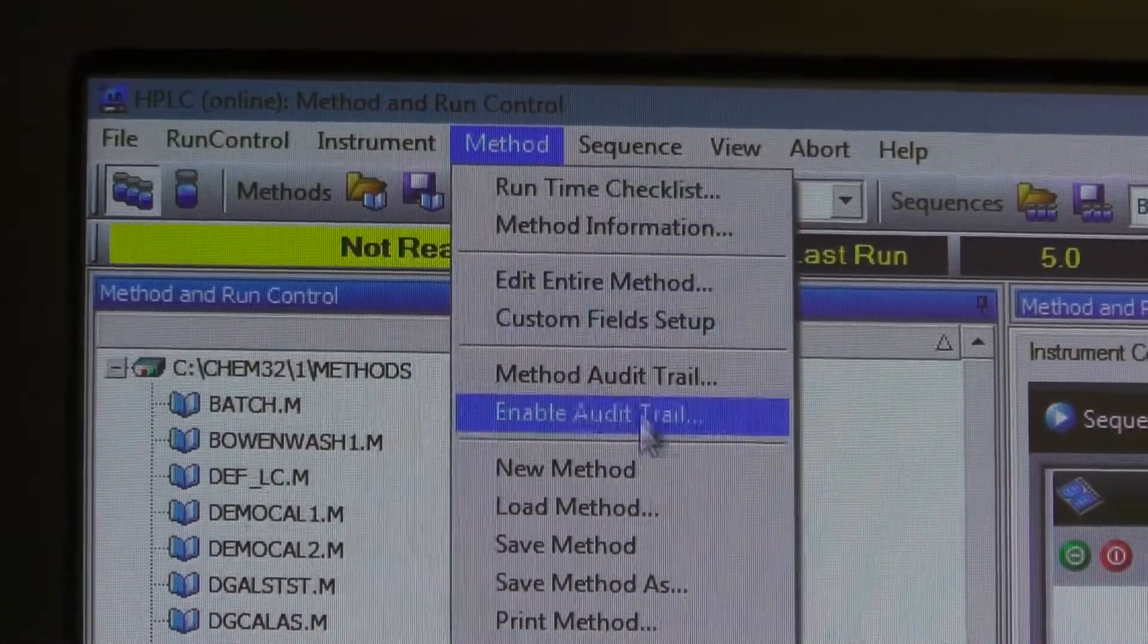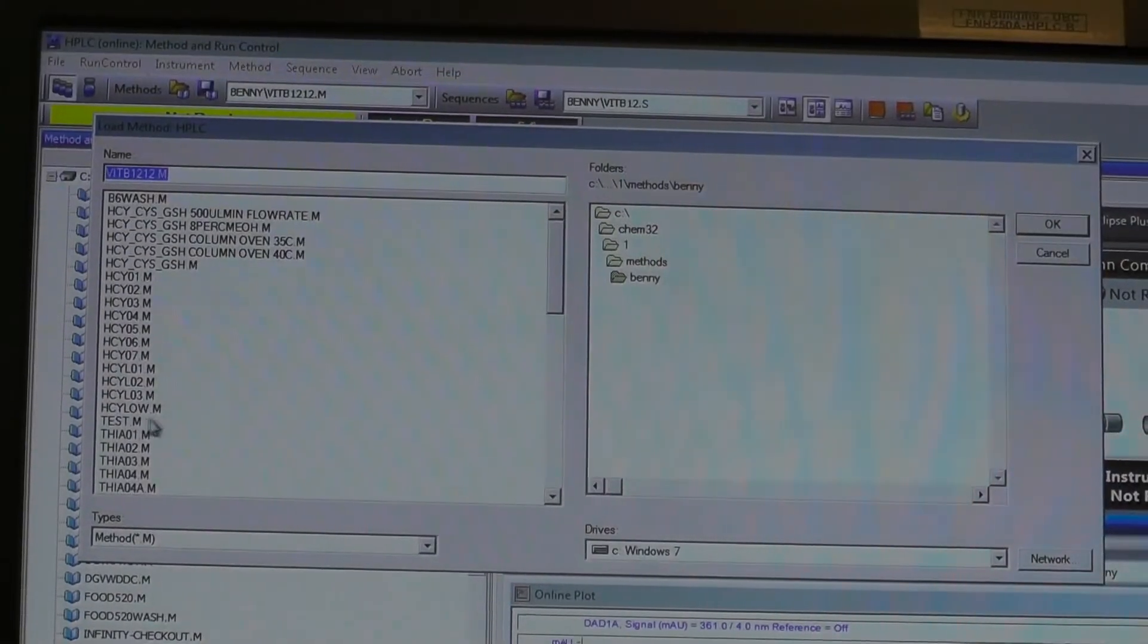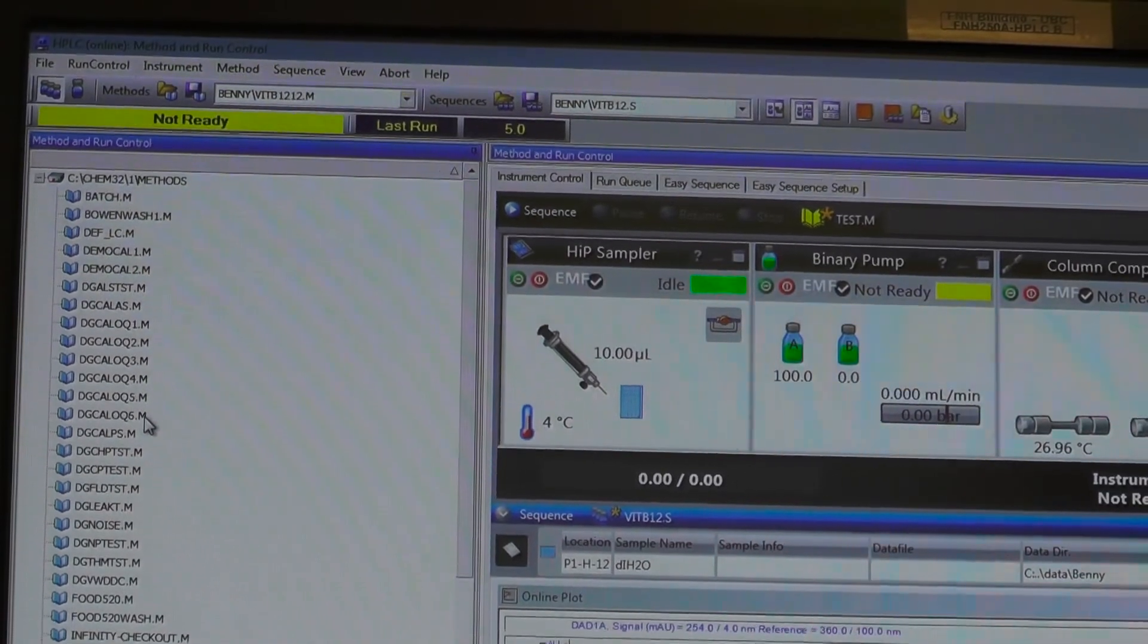Go to the Method menu and choose Load Method. Based on your experiment, you can use the loaded method or edit the method before starting your analysis.